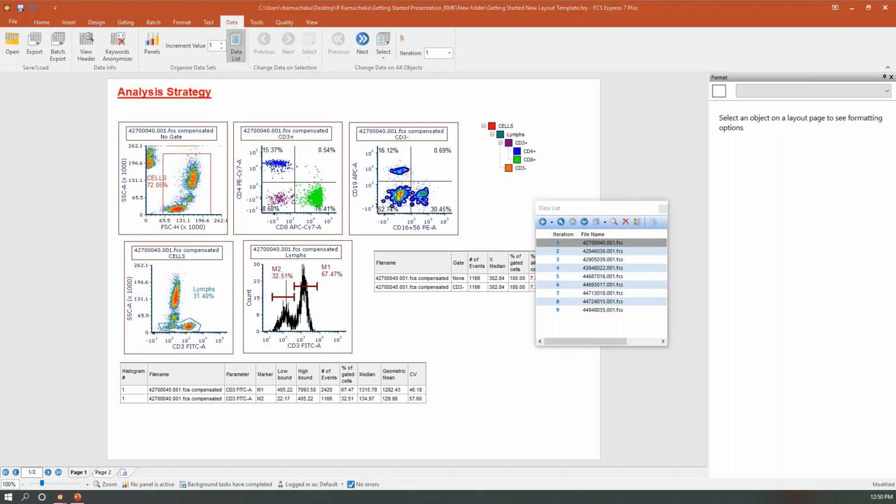Oh, yes, the overlay. Thank you so much. I did forget to do that, didn't I? Thank you very much. So let's go back and look at our overlays.